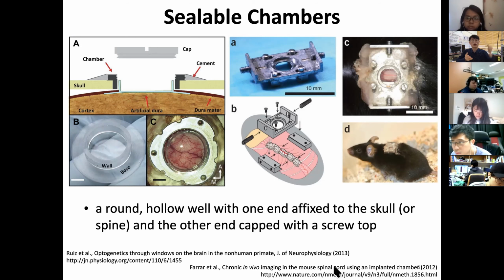How is the distribution of these cells different? Also, you can even insert a microelectrode to measure electrophysiological changes. Because back pain is something many elderly people have, right? My both parents have gone through spinal surgeries. So this is also very, very important to study at the microscopic scale.